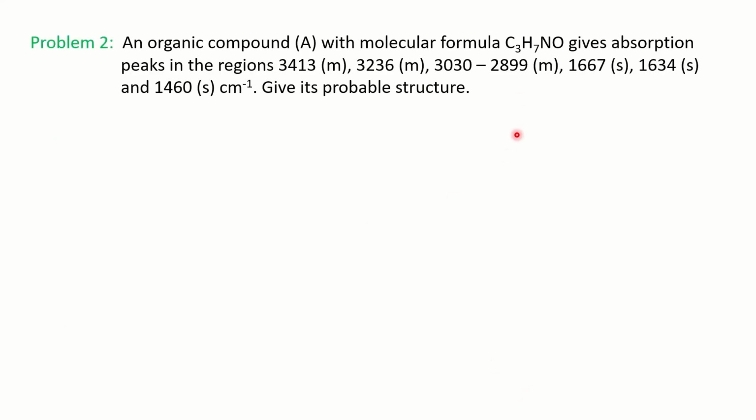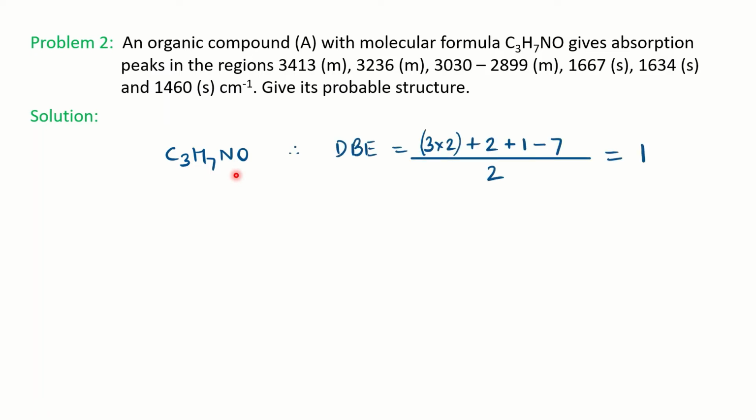The second problem, again the molecular formula is mentioned here, and here only the IR data is given. So let's see. First step is the same, DBE calculation. So one unsaturation is present. We'll see the IR data here.